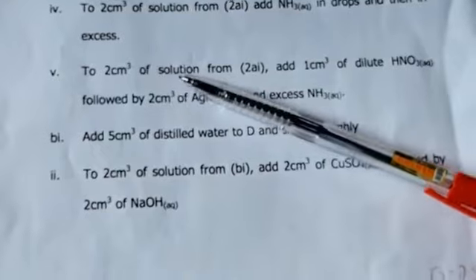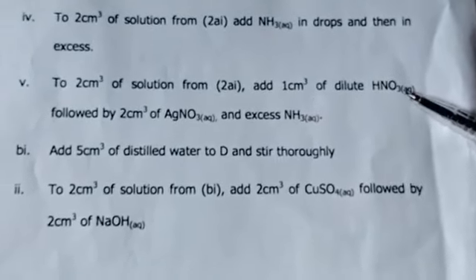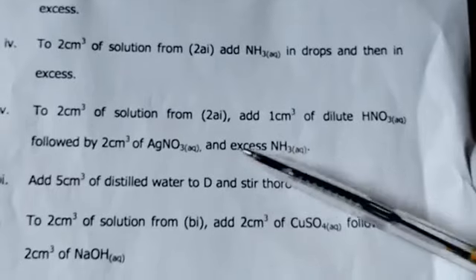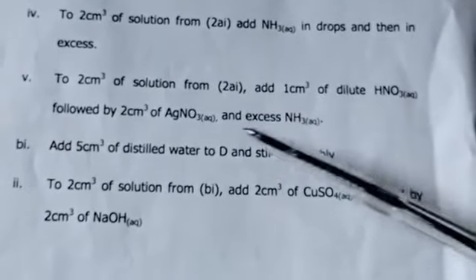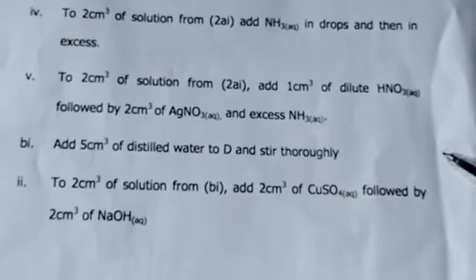It says to 2 cm³ of solution from 2AI, that is C aqueous, add 1 cm³ of dilute HNO3, followed by 2 cm³ of silver nitrate, and then excess ammonia. So let's go to the test.